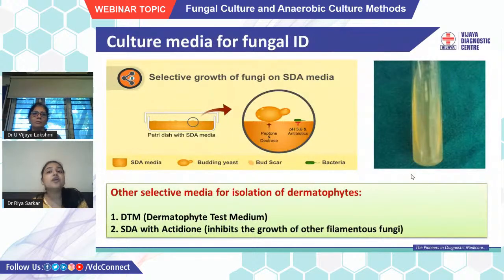As you all must be aware, the media is SDA, Sabouraud's dextrose agar. This is a special media for fungal culture because it provides certain environmental conditions for fungus, like the presence of peptone and dextrose, the pH towards the acidic side, and the presence of antibiotics like gentamicin, chloramphenicol, and tetracycline, which inhibit the growth of bacteria, if any, present in the clinical sample.